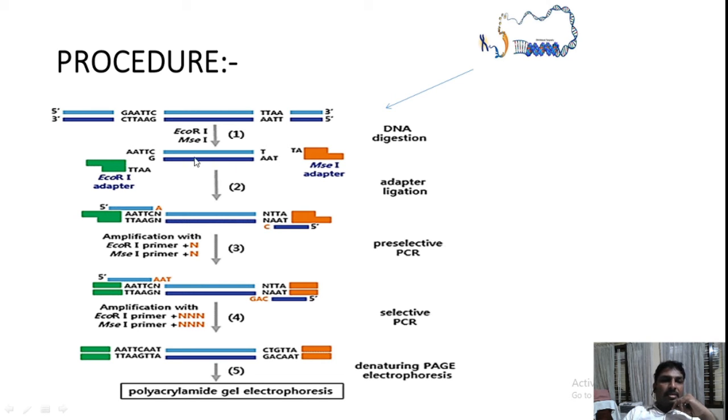Then what is happening is that this is your DNA. This is one of the DNA fragments, and this is an adapter, and this is also an adapter. After adding this ligase enzyme, this adapter will join over here, and this adapter will join over here. That means these fragments will get ligated. Okay, clear. So now the entire adapter plus fragment plus adapter is shown over here.